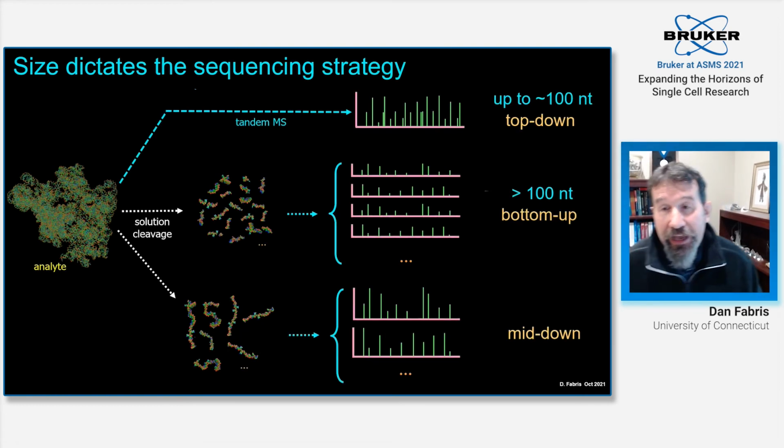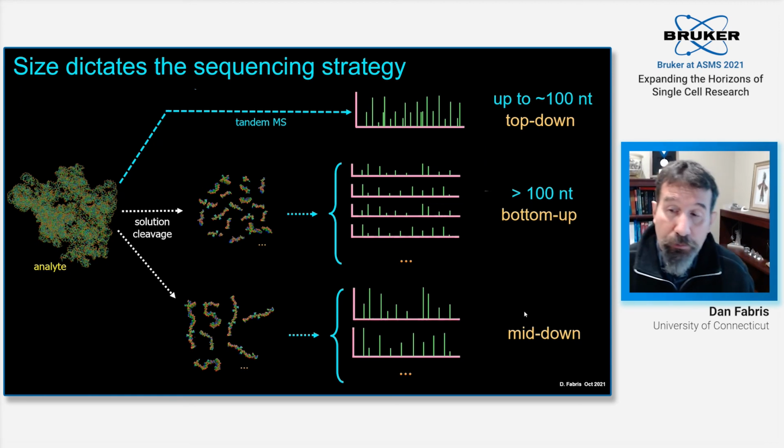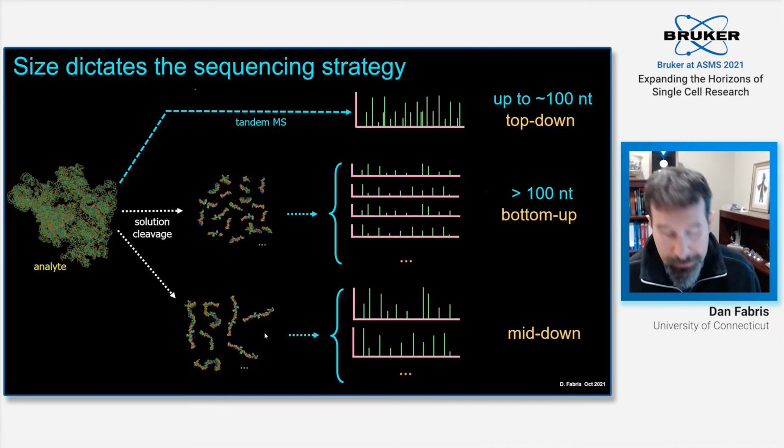So at the end, what I would like to state is that by using this strategy, we can perform what has been called, for protein analysis, a mid-down strategy, where we limit the solution cleavage step to obtain larger fragments that are less prone to ambiguous determination.